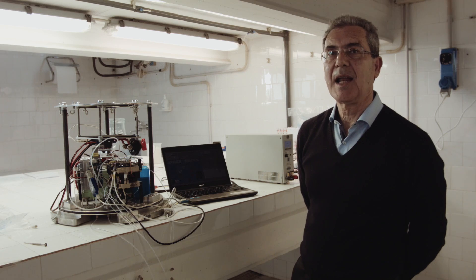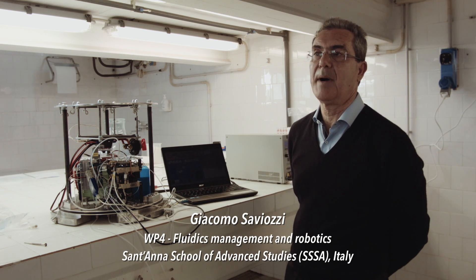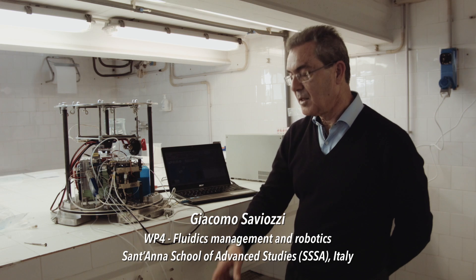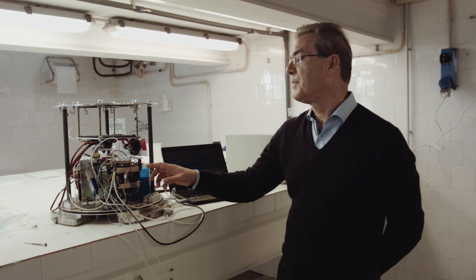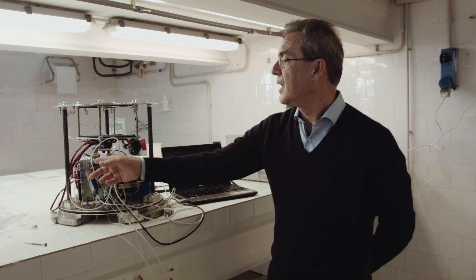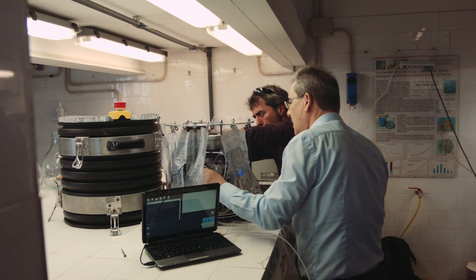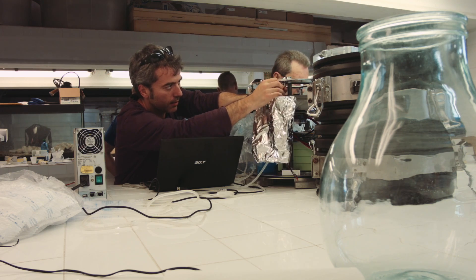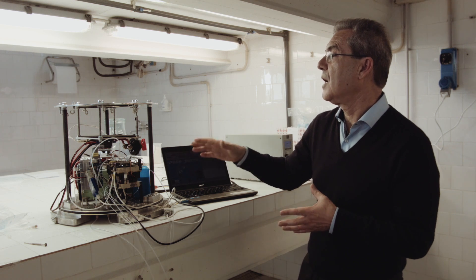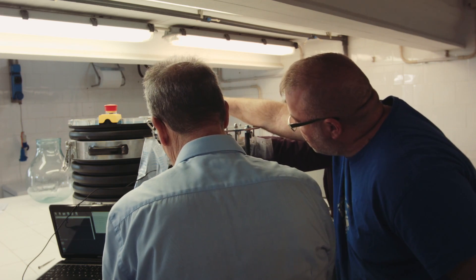In WP4 we realized the sampling system and the microfluidic system together with our partners. The sampling system gets the water from the sea and the microfluidic system prepares the solution for the biosensor cell. The biosensor cell will then measure the pollutant inside this solution. The microfluidic part is also prepared to clean the biosensor cell because we have to execute multiple measurements in a day and the system should be autonomously working for a month.